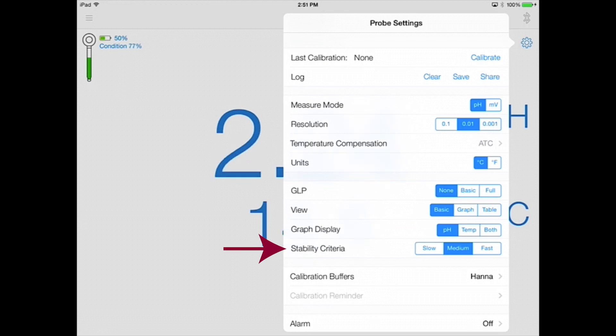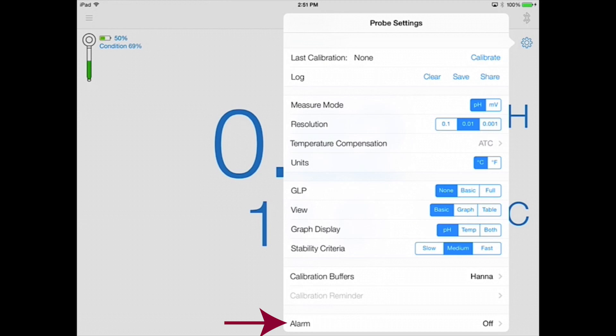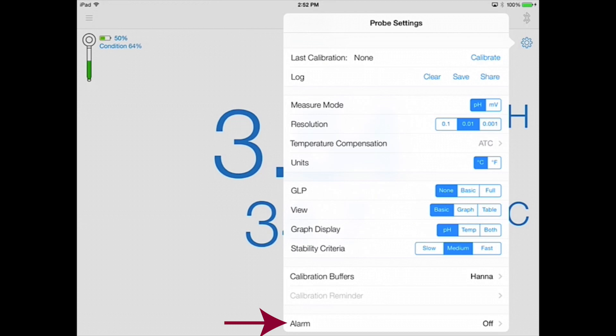Finally, there are options for selecting your buffer set, setting a calibration reminder, and setting a measurement range alarm. If this feature is enabled, measurements outside of your defined set points are highlighted on your tables and graphs for easy viewing.